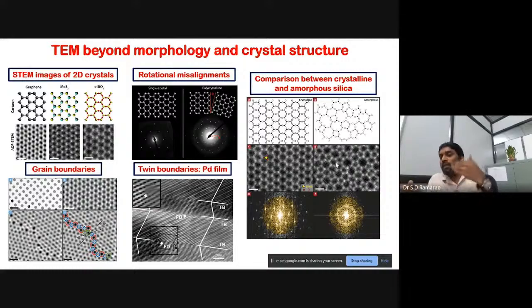If it is amorphous, you also get that directly from XRD. But in support of that, let us say you are collecting your powder diffraction data by placing your sample on a glass plate. There is a possibility that when collecting the X-ray diffraction, instead of getting the data from the sample, you may end up with data coming from the glass plate.